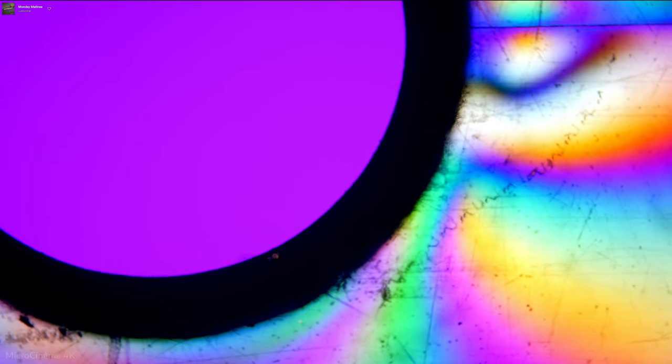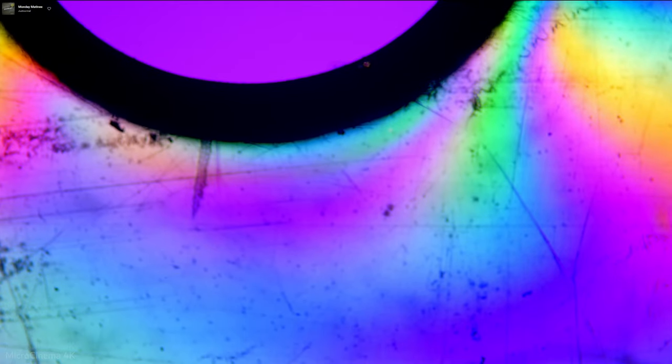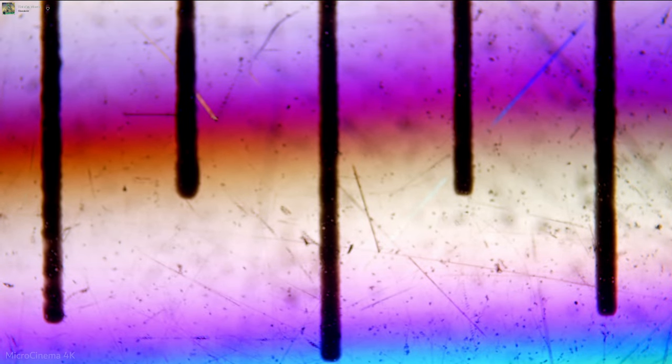So one of the things I recommend, Marco, since you just got some polarizing film, is to take two sheets of your polarizing film and cross them against each other. If you can backlight them with something, then just start putting plastic things in between them, like plastic sheeting, plastic objects, clear plastic stuff, and start turning it and playing with it. You'll find some really interesting stuff. In fact, a lot of plastics can be used as half wave plates. It's so weird.